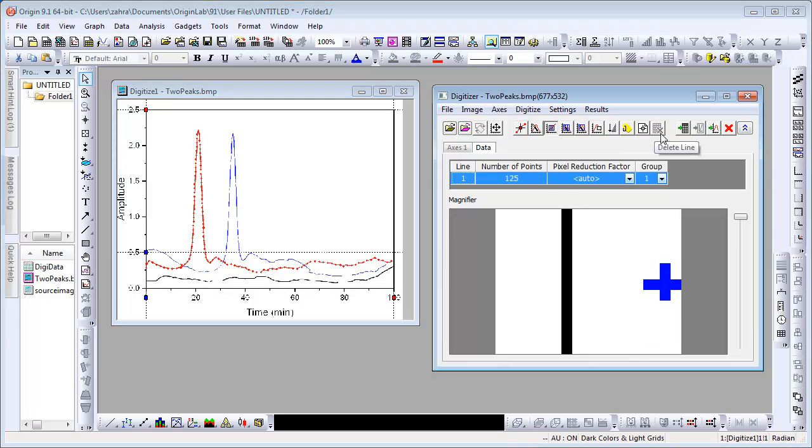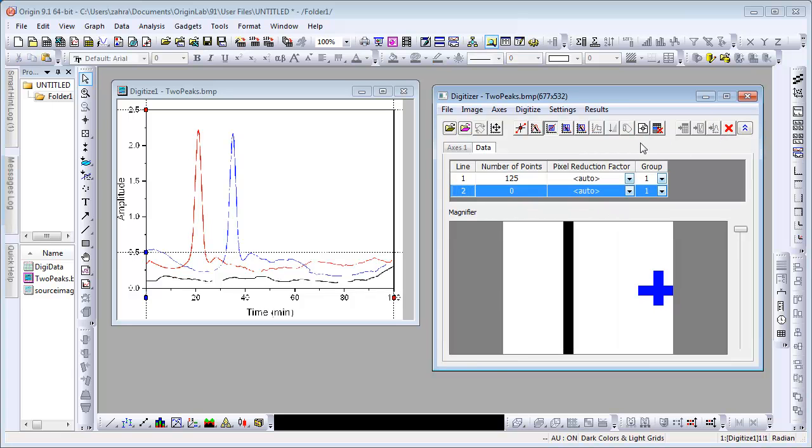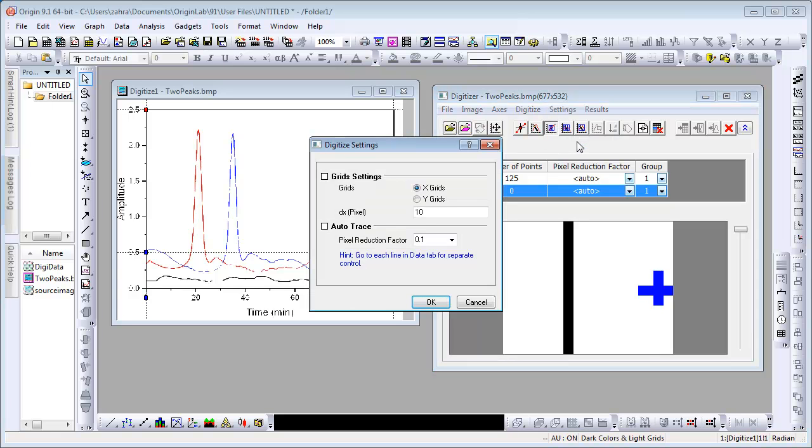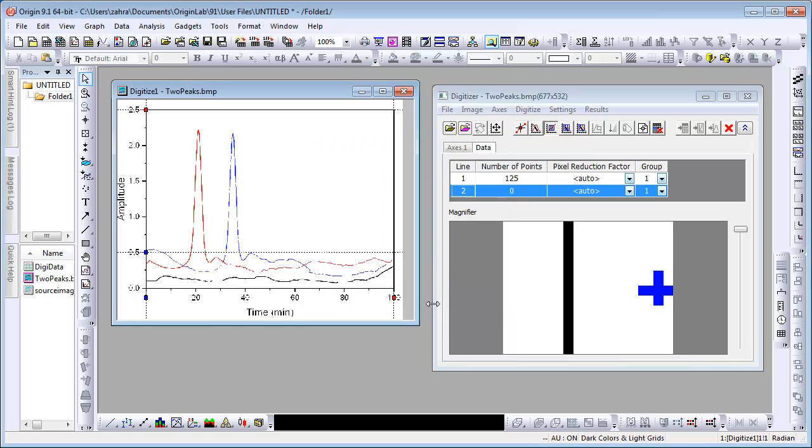To delete all the lines, you can use the Delete All button but we will not use it today. Start a new line again for the black baseline. We want to increase the density of the grid so under Settings, Digitize Settings, we change the pixel number to 5. Click OK.